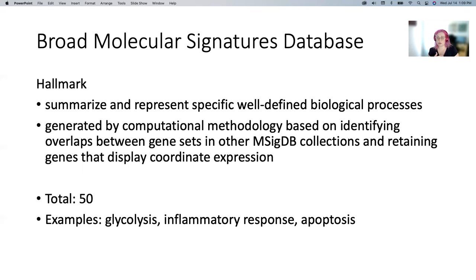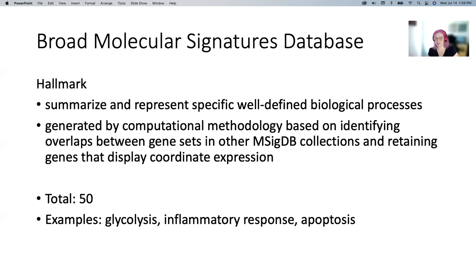Hallmark is the one we'll use most heavily — it's the one we always start with because it's usually the most interpretable. There are only 50 gene sets representing things like glycolysis, inflammatory response, and apoptosis. The caveat is that because this is the most heavily curated, those 50 gene sets represent about 4,400 genes, and there are a lot more than 4,400 genes in the human genome. So you do miss some things with this. But the other gene sets we'll talk about can often get what you miss, which is why we run more than one.